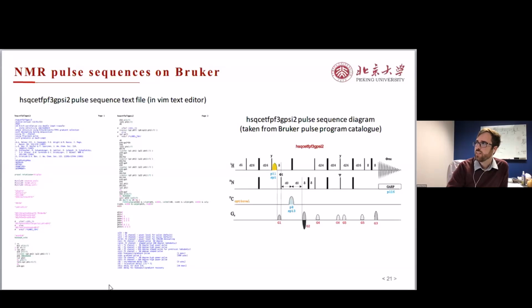I guess to some extent it's limited by the actual polarization transfers. You have to have enough time for the actual experiment to happen, if you are no longer really worried about the duty cycle.